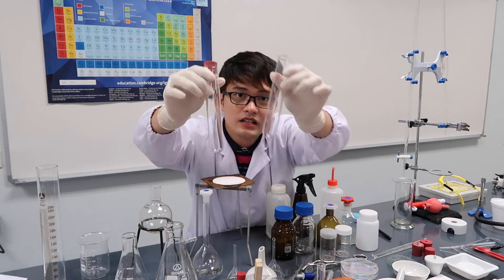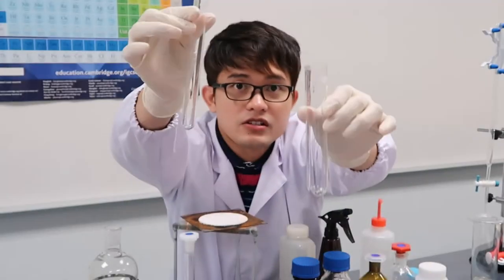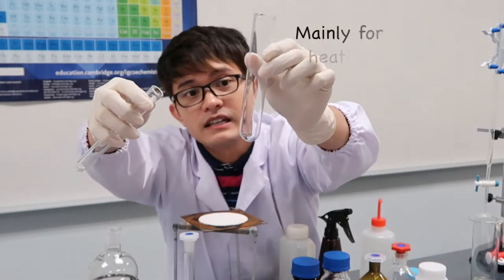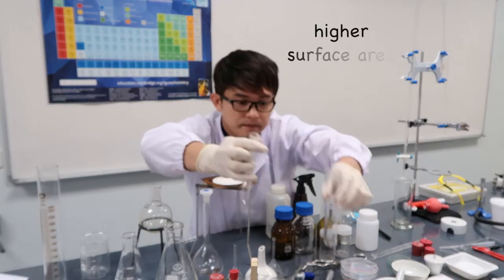And then we have our boiling tubes. The difference is that the boiling tube is fatter than the test tube. This is used for heating — you can heat in a test tube too, but it's easier in a boiling tube because it has a larger surface area.